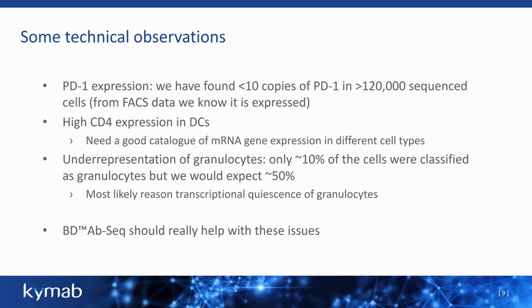The other thing that I found interesting, which is well known, but I think it doesn't hurt to reiterate, is that CD4 expression is not actually exclusively seen in T cells. There's a considerable level of CD4 gene expression in myeloid cells, particularly in DCs.